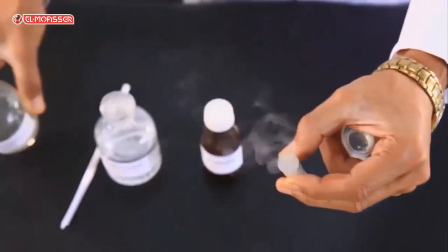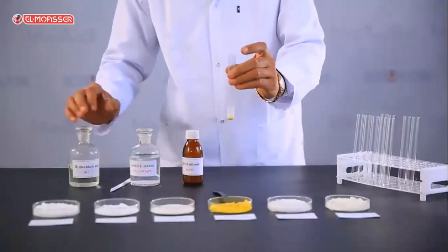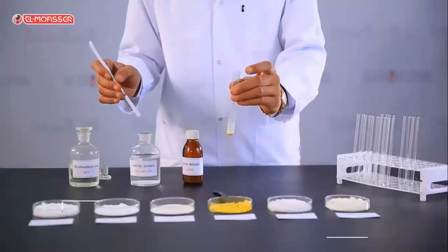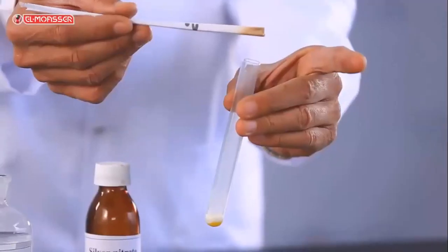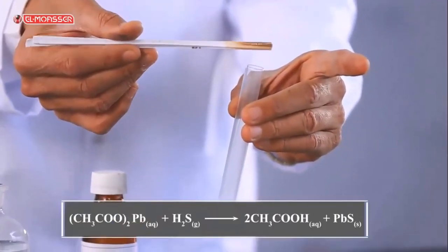What do you observe? Effervescence is observed due to the evolution of hydrogen sulfide gas, which has a rotten eggy smell, which turns a paper wet with lead acetate into black.